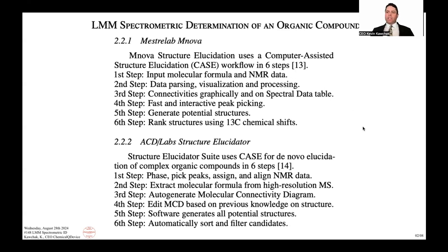Okay, so what we see, and you can actually take a look at the manuscript. This ChemRxiv, along with the previous ChemRxiv, are both up. I go in depth on the academic studies. I'm not going to mention them here, but this is basically the state of the industry as far as the software that's available.